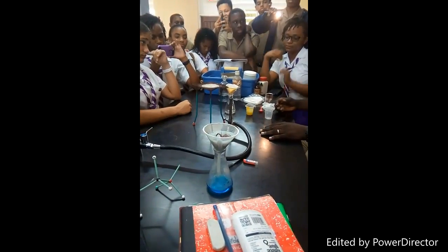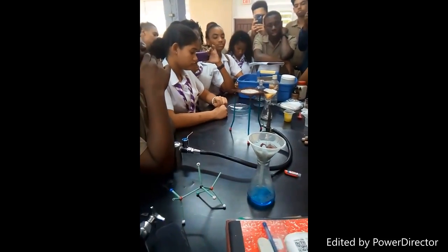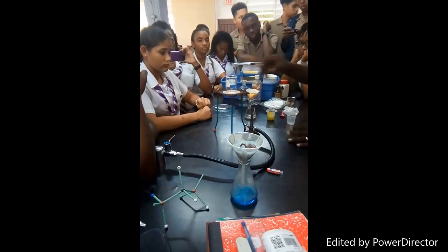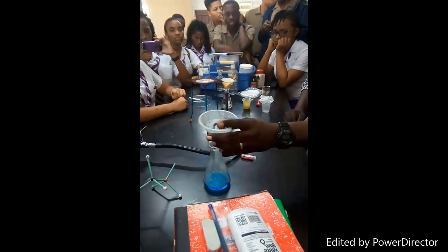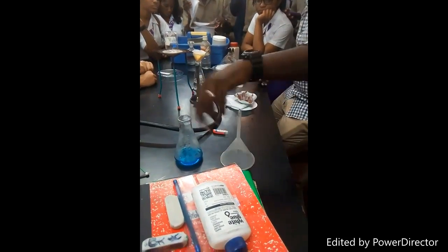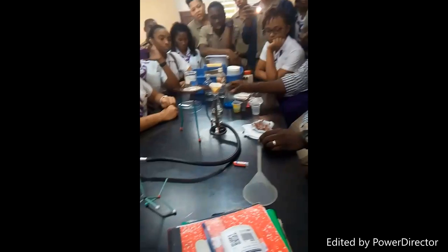Okay? Now, having done all of that, let us put this on the fire and use a beaker. We're going to just cook this for a little bit. And that's our residue. We're not concerned about our residue. What we want is this nice blue substance. So we're just going to light a fire.